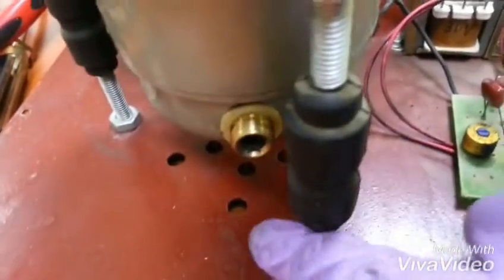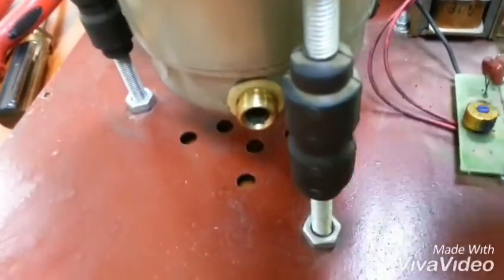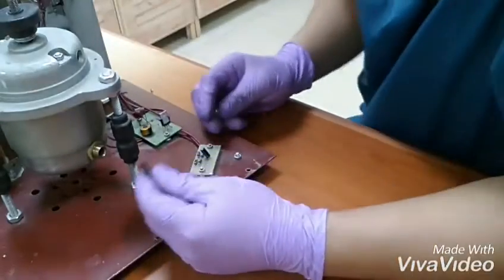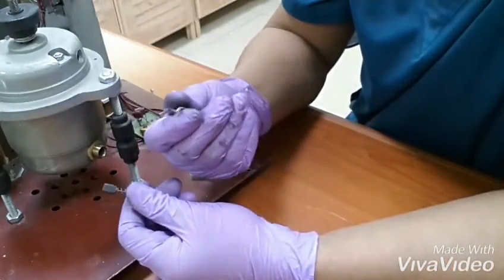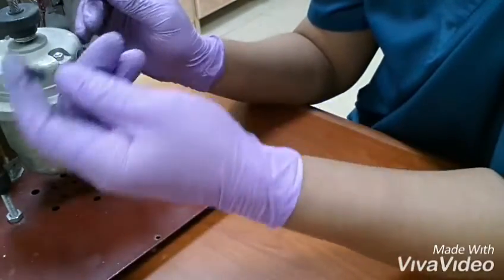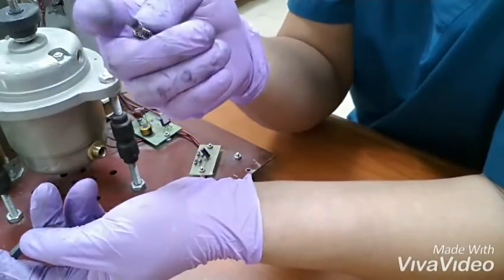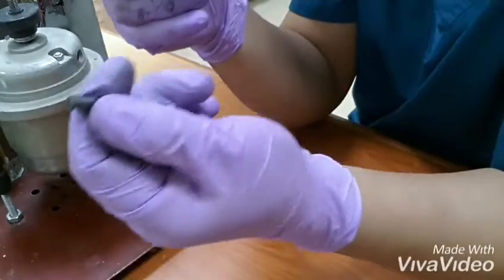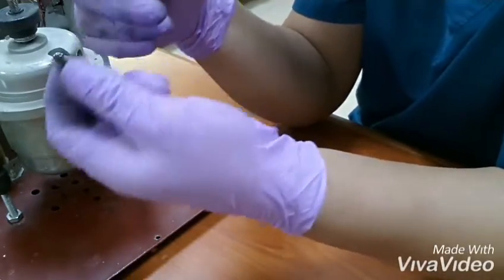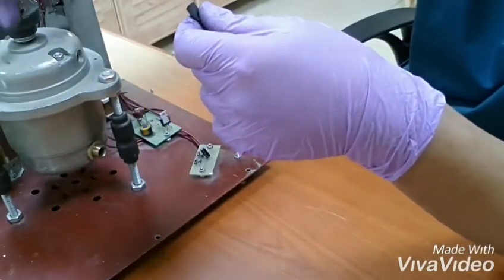So the carbon brush, there are two — from this one and the other side. As you see, after I remove the carbon brush from the motor, as I notice, it's already very small. The carbon brush is already very small. So I think this is the problem of the machine — why the motor is not working.